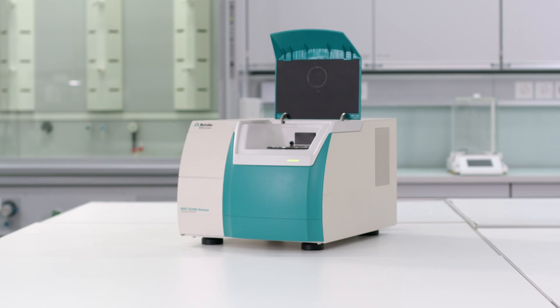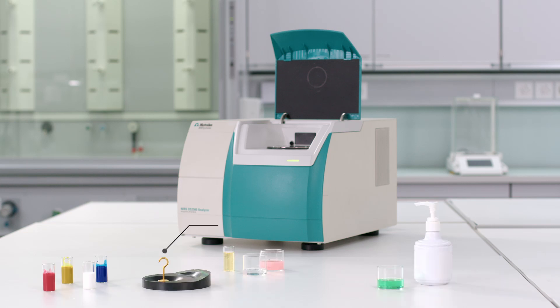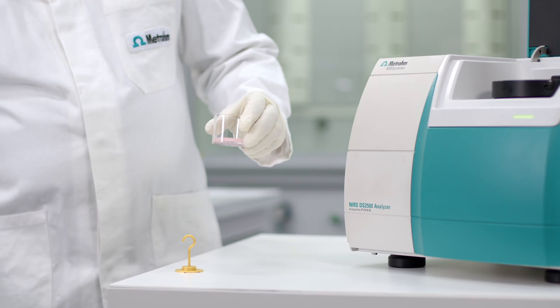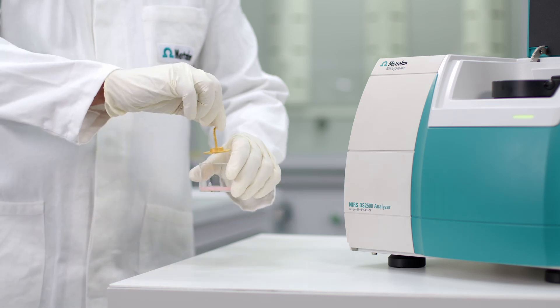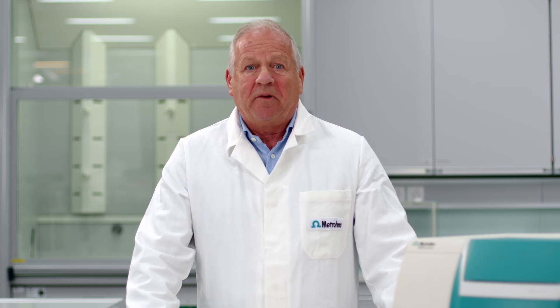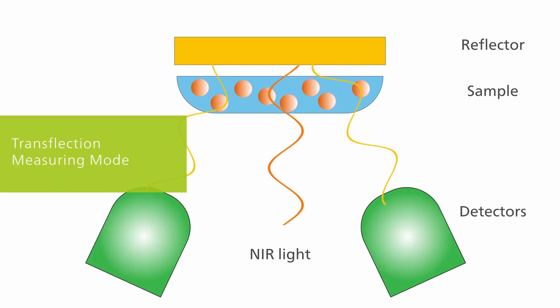With the DS2500 solids analyzer it is also possible to measure liquids, pastes and gels using the gold reflector combined with the slurry cup or the glass vessel. The reflector with the defined gap size is placed on top of the sample. For such samples the transflection mode is used. The NIR light is partially absorbed by the sample and any unabsorbed NIR light is reflected to the detector. The path length is twice the gap size of the reflector.